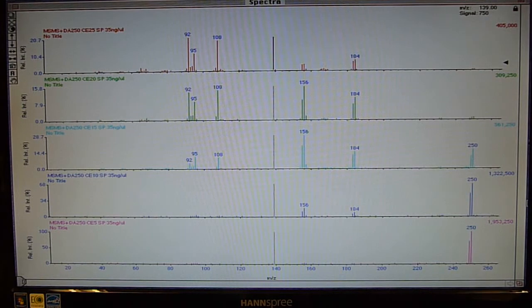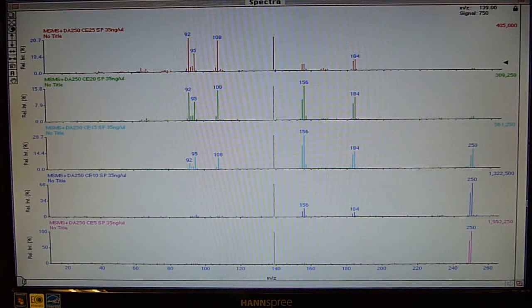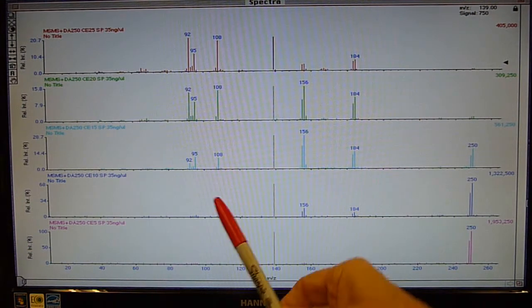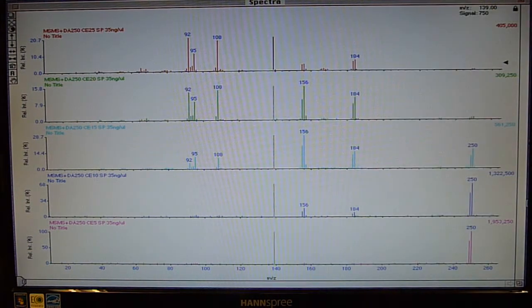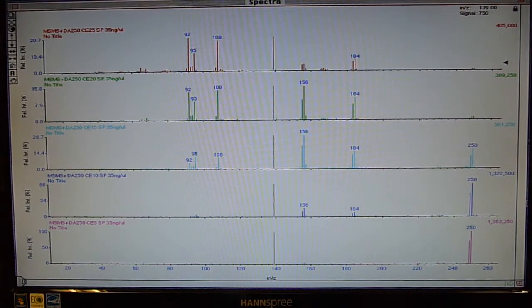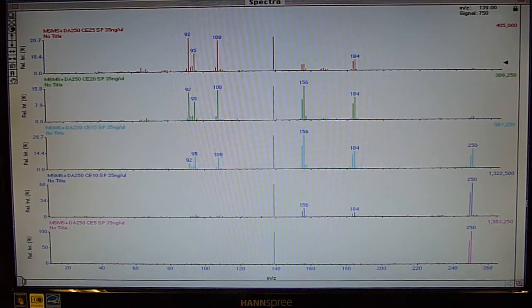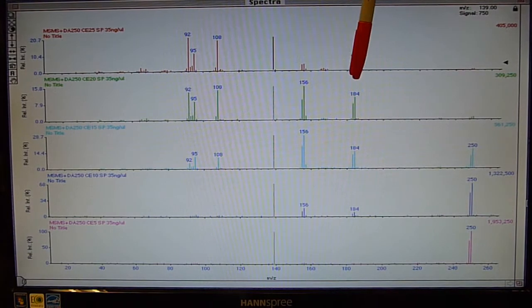Looking at the effect of collision energy for the sulfur dioxide expulsion - at 5, 10, 15, 20, and 25 volts - you can see why electron impact at 70 eV shows no molecular ion at all: by the time you get to 20 eV, you're essentially getting no molecular ion and are converting entirely to the sulfur dioxide expulsion and other fragments.